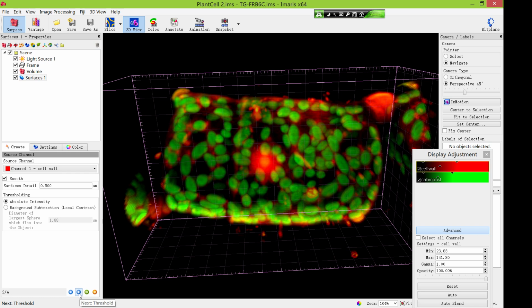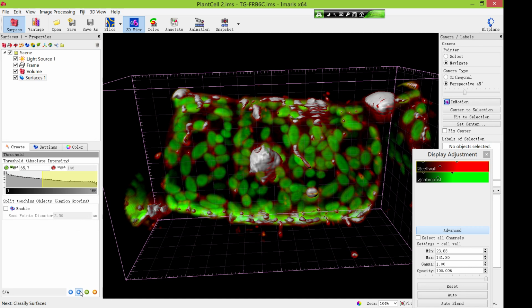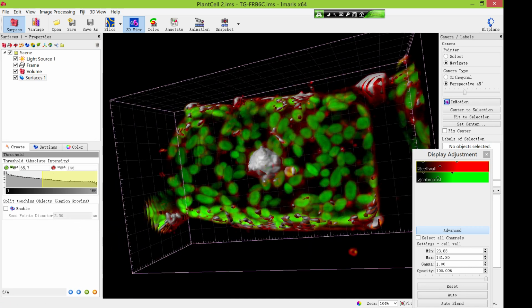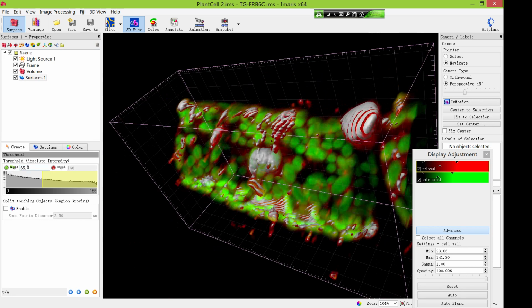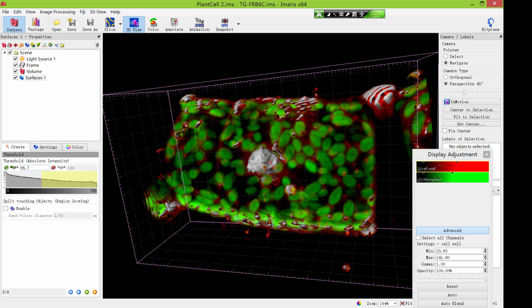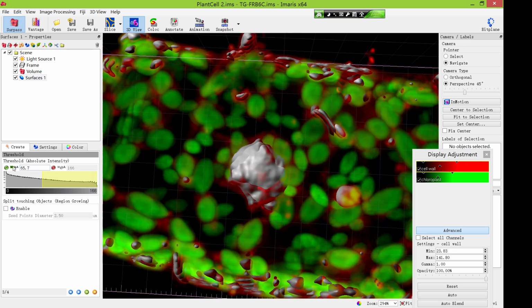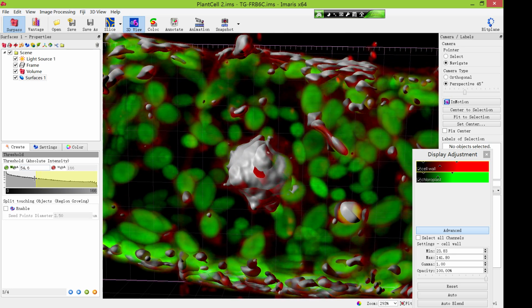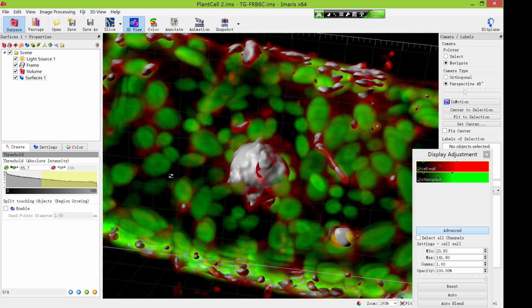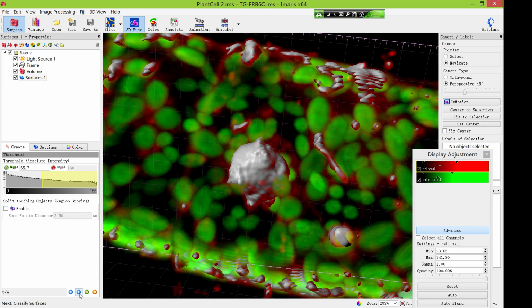So you just click next, and the threshold. The important thing is that the threshold is also reused from last time, 65.7. But if you think this is not appropriate for the next image, you can manually adjust it a little bit to make it fit better. Then you can just click this next, or you can also just click the double arrow, so you can go directly all the way to the end of the steps.